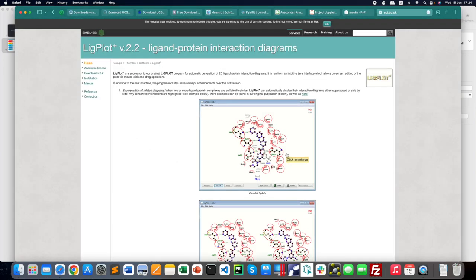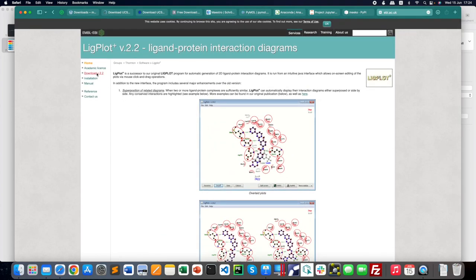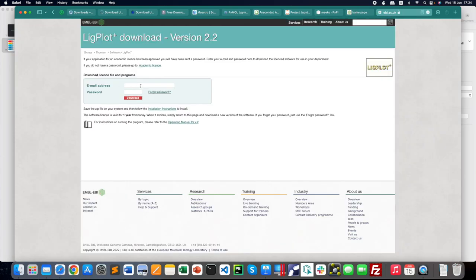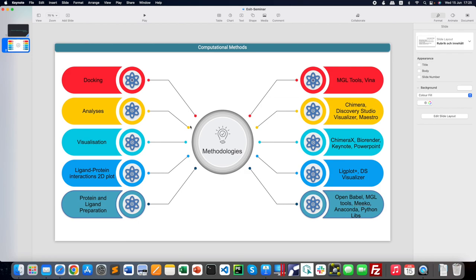The next software is LigPlot+, a platform to show protein-ligand interactions, bonding patterns, hydrogen bonds, hydrophobic bonds, and distances between bonds—all easily deciphered using this software. For download, go to the academic license form, fill it out, and within about one day you'll receive the LigPlot+ zip file at your academic email address. It is a JAR file, so Java is required.